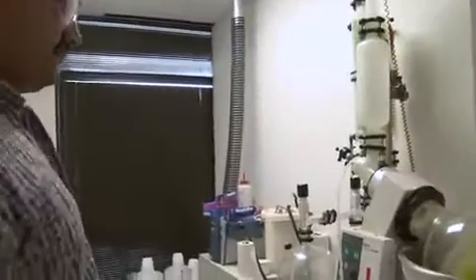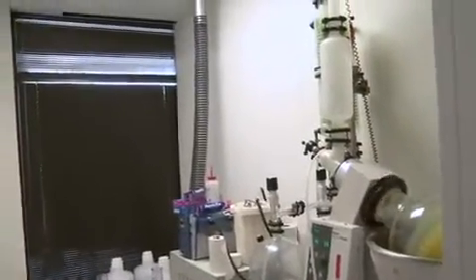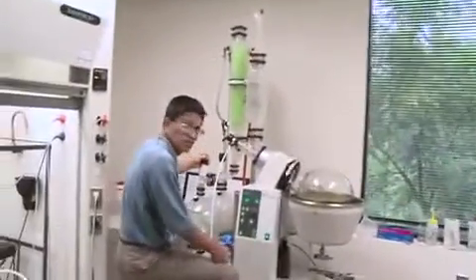This is R220 number four, and there will be number five in this room shortly. This is our newest one just put into service yesterday.